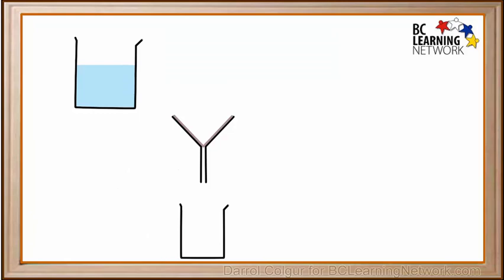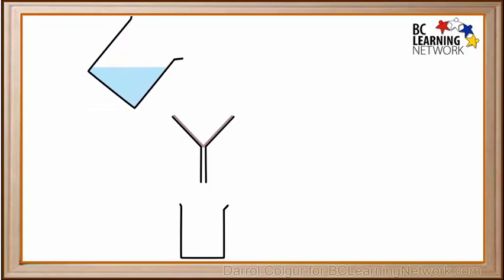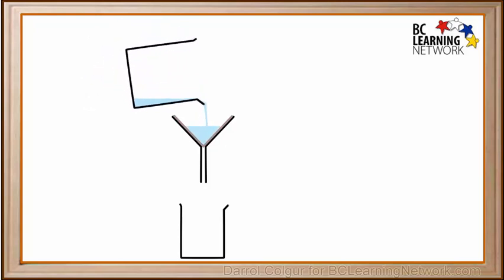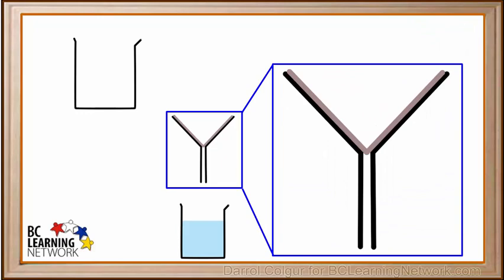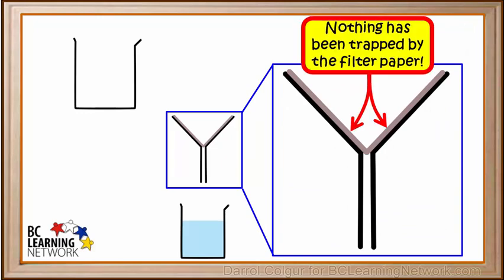We place a beaker on the bottom to catch any liquid that runs through the filter paper. Now let's see what happens when we pour the window cleaner solution into the funnel. We see that all of the solution runs through the filter paper into the beaker at the bottom. If we take a closer look at the filter paper in the funnel now, we see that nothing has been trapped by the filter paper. This is true for all solutions. Even though solutions are mixtures, these mixtures cannot be separated by pouring them through a normal filter.